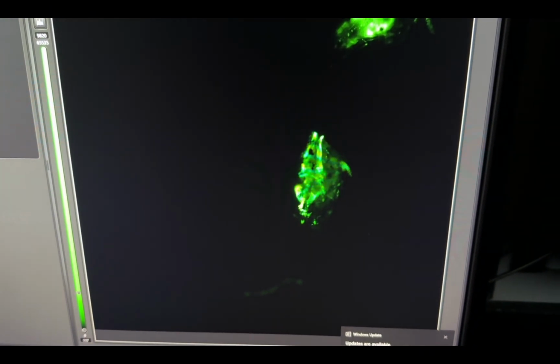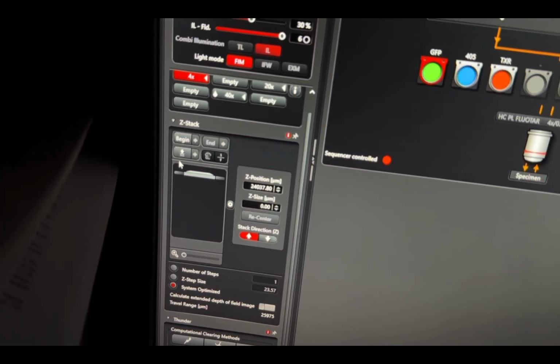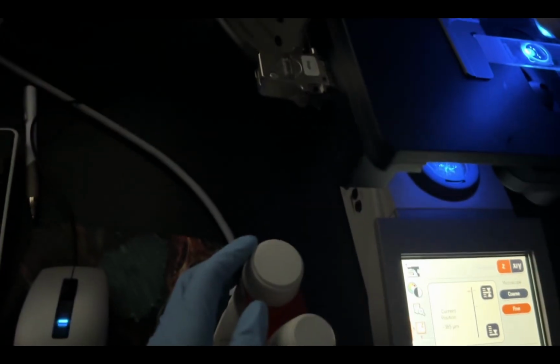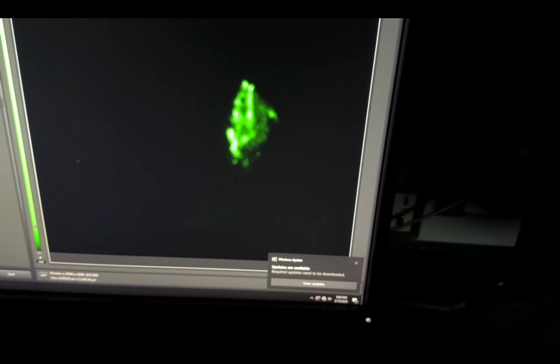So I would say this is maybe the earliest where I can discern things. This is an area I like to start. So I go over here and I click begin. Now I'm gonna start twisting it clockwise in order to get the other opposite, the other extreme bound in which I'd like to stop. So I'm gonna keep twisting it clockwise now until it goes out of focus again. So that's pretty blurry. Let me see if I can catch it right before.